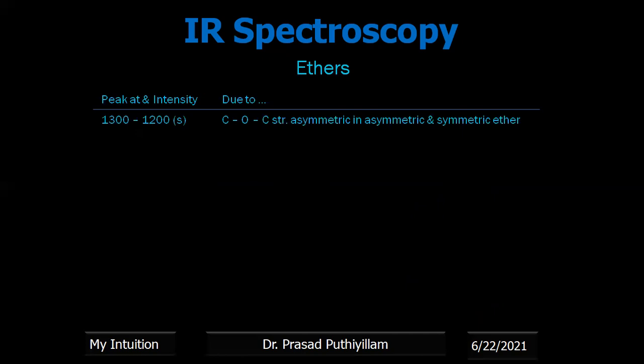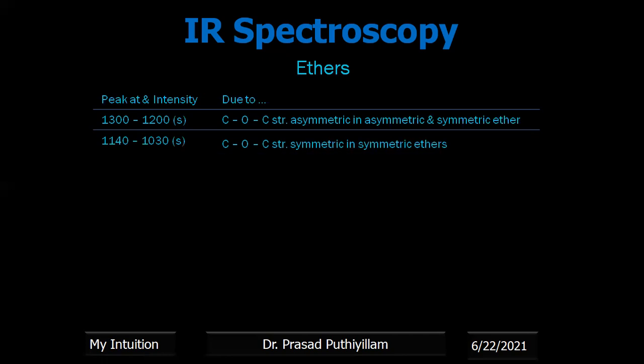So we know ether is of two types, asymmetric ether as well as symmetric ether. Both symmetric as well as asymmetric ether will give asymmetric COC stretching and give a peak around 1300 to 1200. If a strong peak at 1140 to 1030 is observed, that is due to COC symmetric stretching in symmetric ether.